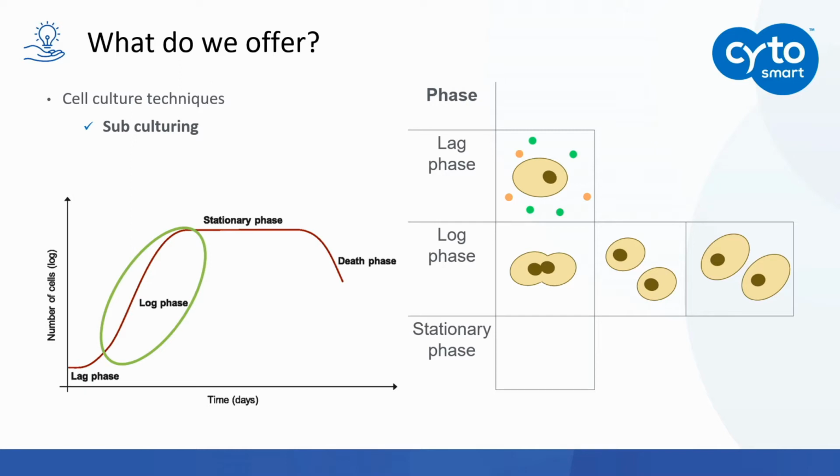In this phase, you will also see an exponential growth in the confluency of your surface. And in this phase, it is also assumed that the cell has the highest viability. So when you want to perform experiments or passage your cells, this is the right time to do it. Because passaging your cells too late can lead to overcrowding, apoptosis, and also senescence of your cells.